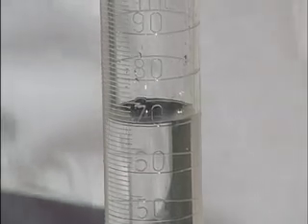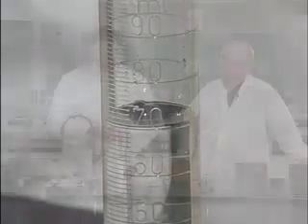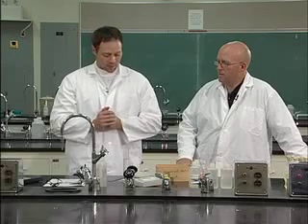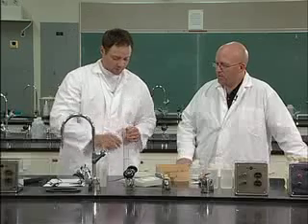So I should record that 70.0 somewhere? You should, yes, you definitely should. You should record your 70.0 as an initial volume. So your initial volume for this part of our measurement is 70 mils. Excellent. Thanks for reminding me.